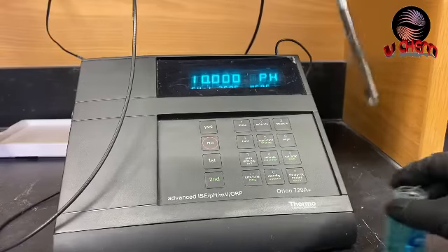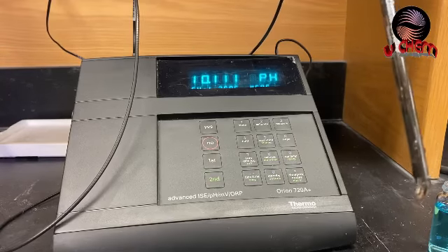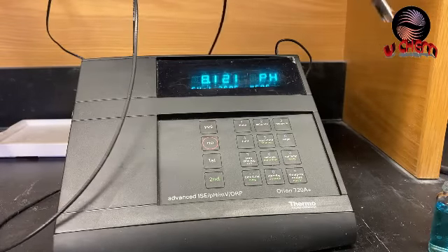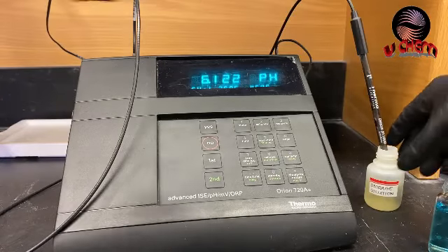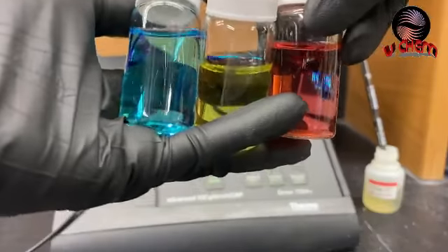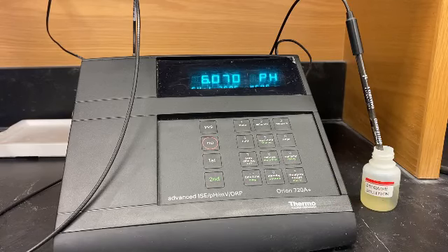We are done with the calibration. I'm gently cleaning the probe, wiping off the water with chem wipes, and putting it back into my storage solution. So guys, we are done with the three-point calibration curve using pH 4, pH 7, and pH 10. Bye for today — see you in another video!